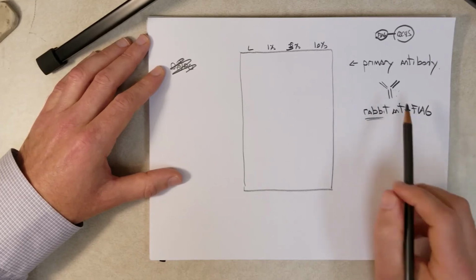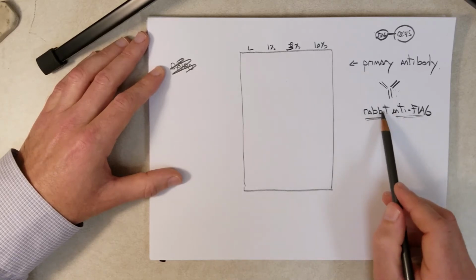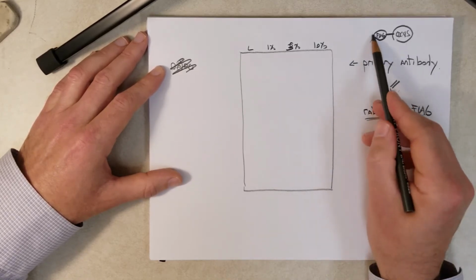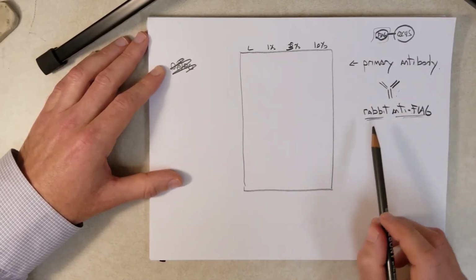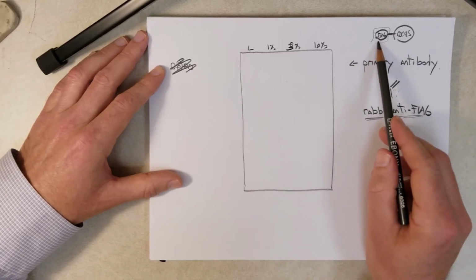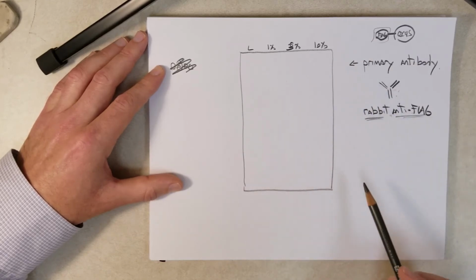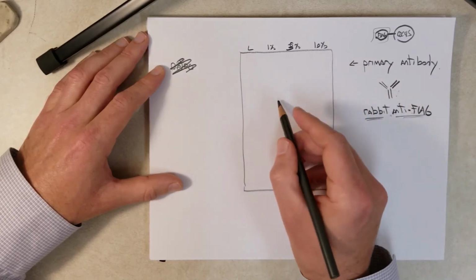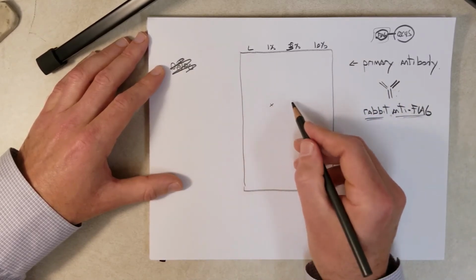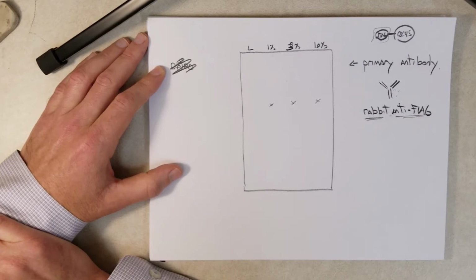And what does this rabbit mean? It means this anti-flag antibody was produced in a rabbit. Some biotechnology company injected a rabbit with the flag protein. The rabbit made antibodies to the flag epitope, and the biotechnology company took blood from the rabbit, purified the antibodies and sold it. So now we can use this in our Western blot if we buy it from the company. Essentially what will happen is that antibody will bind wherever the CDC45 is located. I'm just going to put these X's there because we won't be able to tell where it's located until we do a couple more things.